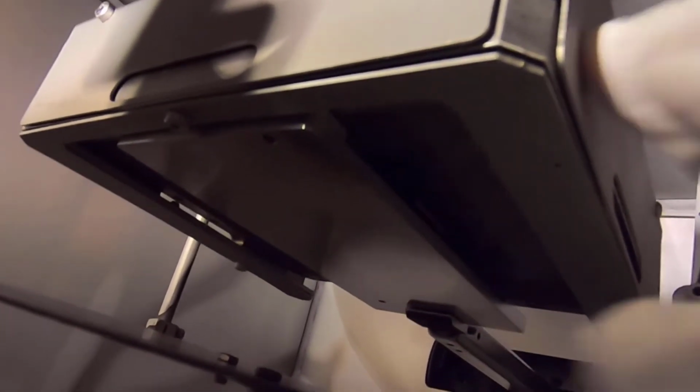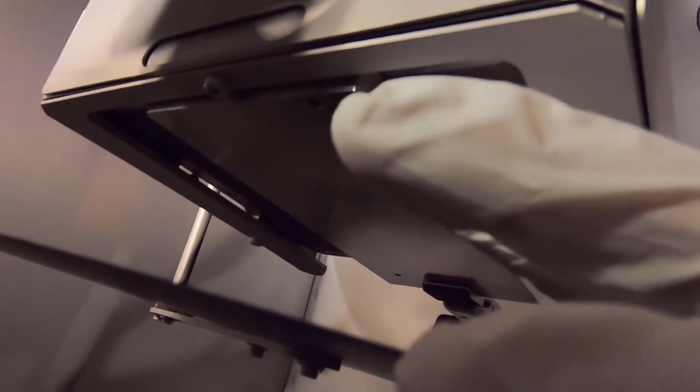So again, right over here, the edge of the paddle has gone up inside here, and it didn't get clipped by this edge of the substrate receptacle, which is again tied to the tower. If this part gets hung on this piece, it's just going to bend the entire arm down. So always watch this corner.